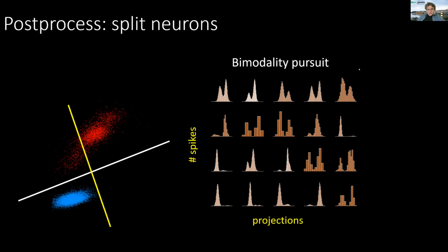Ability to split the neurons in the feature view has not been enabled in Kilosort 3. Well, that is correct. Yes, it has not been enabled in Kilosort 3. And the reason is that it's some kind of minute work that requires me to focus on, and I haven't had the time to do it. So sorry about that.